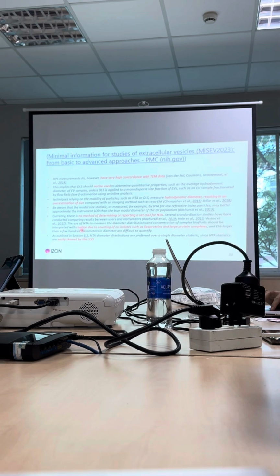Also, you see that due to counting co-isolates, if the sample is not pure, if lipoprotein and large protein complexes are in it, they have different parameters compared with the EV. If the sample is slightly impure, NTA will give you very different results. That's why we say we need the EV sample to be as pure as possible.